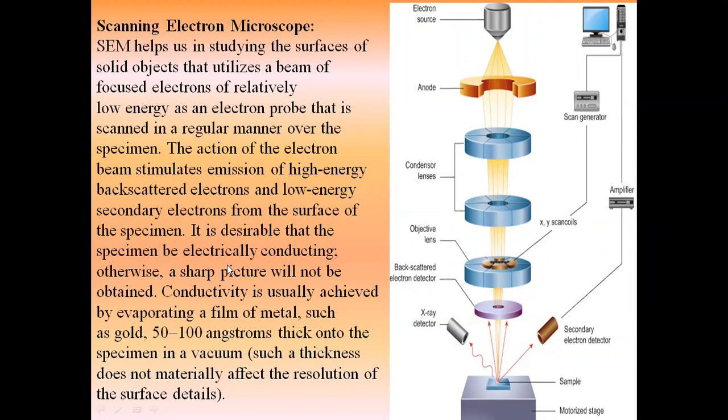When you are following those processes of electron microscopy, while making the sample ready for the analysis, you have to do fixation, rinsing, secondary fixation, and then dehydration. As a result, the cell is going to dehydrate and die. Once the sample dies, it will no longer be a living cell. So it is obvious that whatever sample we are using should be non-living.